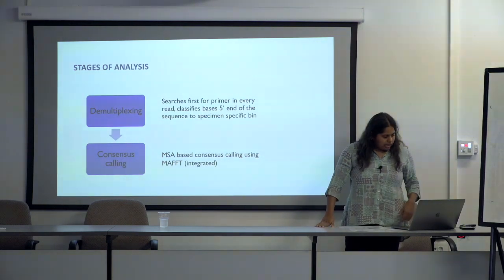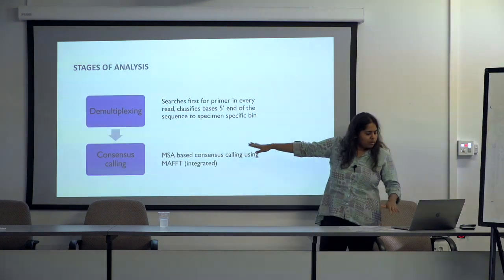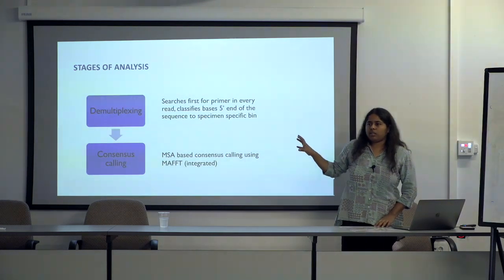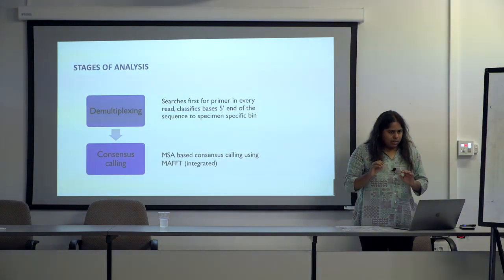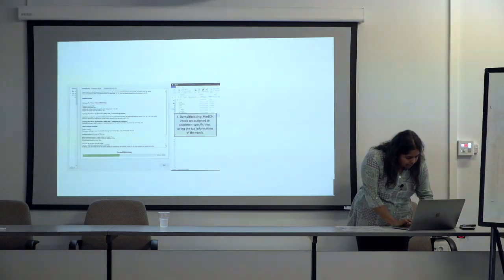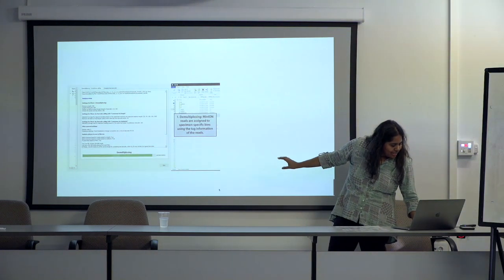But for ONTBarcoder, when we moved from MiniBarcoder to ONTBarcoder, the change was basically that we trained MAFFT's alignment parameters based on ONT data and used that model to align the data. That gave slight improvements over just reducing the opening penalty. I think this is like a video because I want to just pause and start, which would be hard in the real live version.